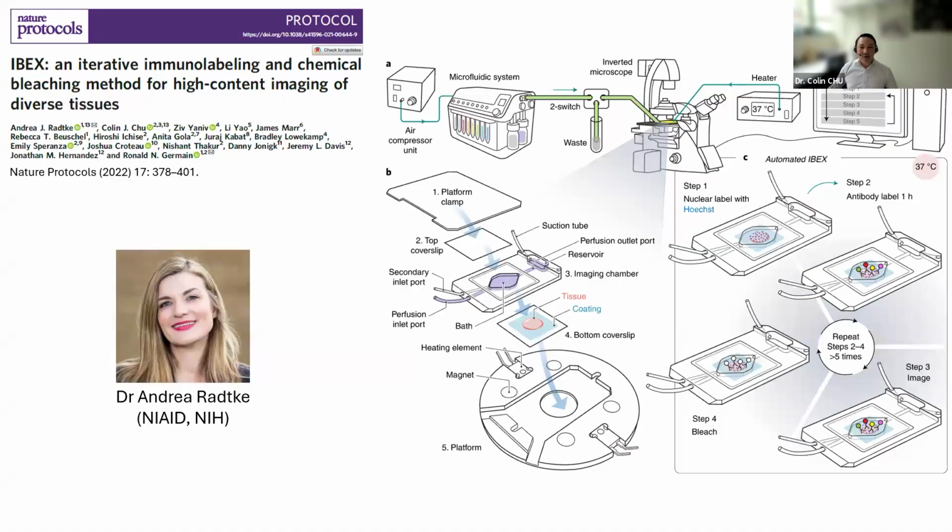And so that led to this publication, which please do go and read, and again was a wonderful collaboration with Andrea. And we essentially worked by combining different elements from different companies to achieve what we think is a very practical and actually very cost-effective solution, and really facilitated for me as not an engineer but a biologist and researcher through the Aria microfluidic system that enabled us to set this up and interface this very easily.